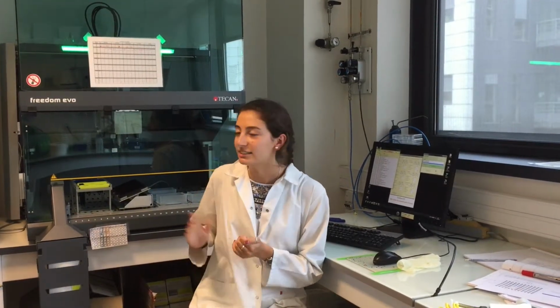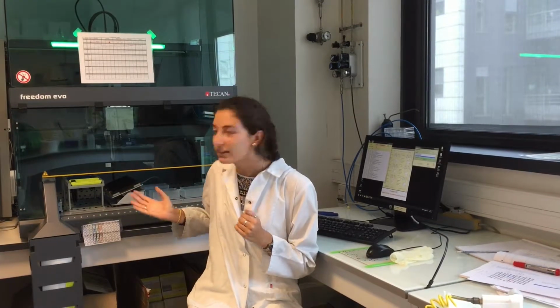It has very fine sensors in the pipette tips so that it will be able to see the exact level of the liquid in your 96 well plates. And it can very accurately pipette in and out the liquid that you need. So mainly the way that it's used is that it will first pipette in the polycation, wait a certain amount of time, which you program into the computer over here, and then it will do a few rinsing steps, and then repeat the process with the polyanion and work back and forth in order to build up the layers.